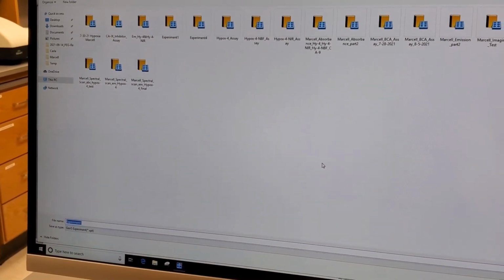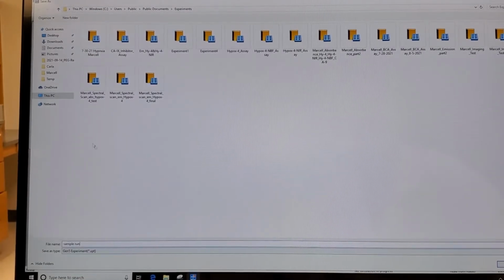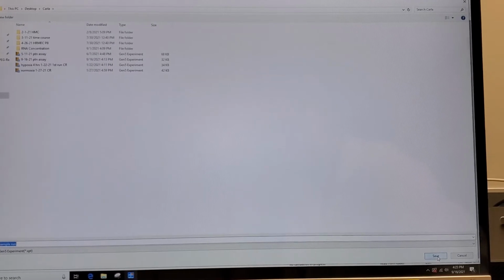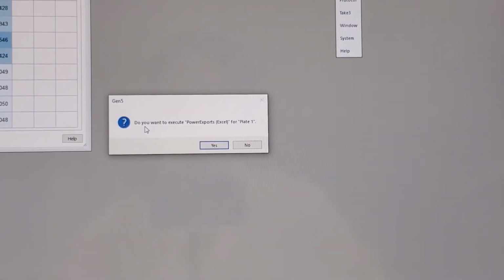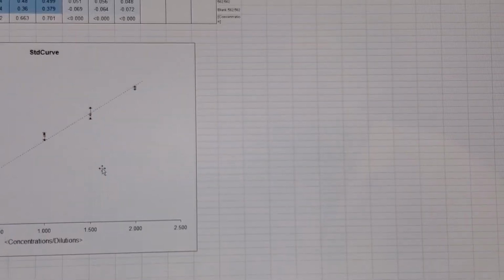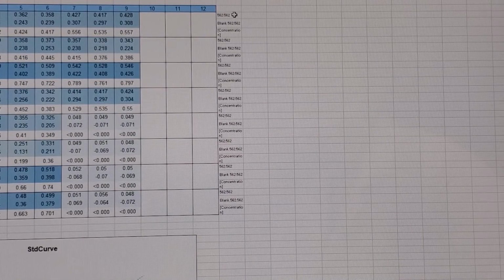Make sure that you put the name of your experiment and save it. I went ahead and named it sample run. I'm going to save it onto my folder. I have a folder ready to go, and once you've labeled it, click where it says open, or in my case, I'm opening my folder and saving it in there. It's also going to ask if you want your values to be saved in Excel. Press yes. I like that it does this automatically for you, and so it will give you an Excel with your standard curve from your protein ladders, and it gives you the raw reads at 562, your blank, and your concentration.